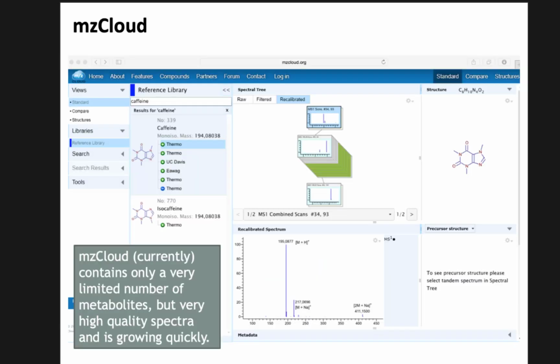You can also go to the vendors. There's mzCloud, which contains a bunch of spectra of very high quality. You can imagine Thermo Fisher does not only sell the instrument, they also sell the compounds, so they just decided to acquire mass spectra of all of them. Again, not a very helpful resource if you want to do any automation, because they have very awkward interfaces to work with.